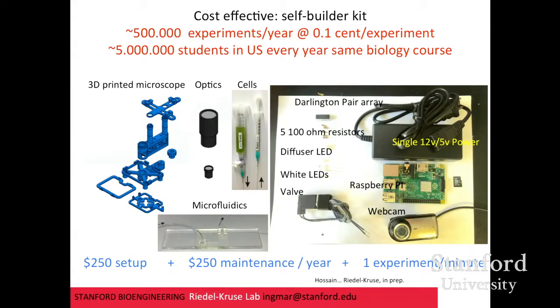So how does this now scale from a cost level, and how useful is this? I think this really can make a difference nationwide and worldwide in terms of education. If you think about it, these experimental systems are rather simple. The setup maybe costs like $250 or so, including a Raspberry Pi and a webcam to operate them. These organisms are very simple and cheap, a certain maintenance cost of maybe $250 a year, and assume that an experiment is a minute long, right? Then you come up that you can run about 500,000 experiments a year for much less than a cent per experiment, on any given system.